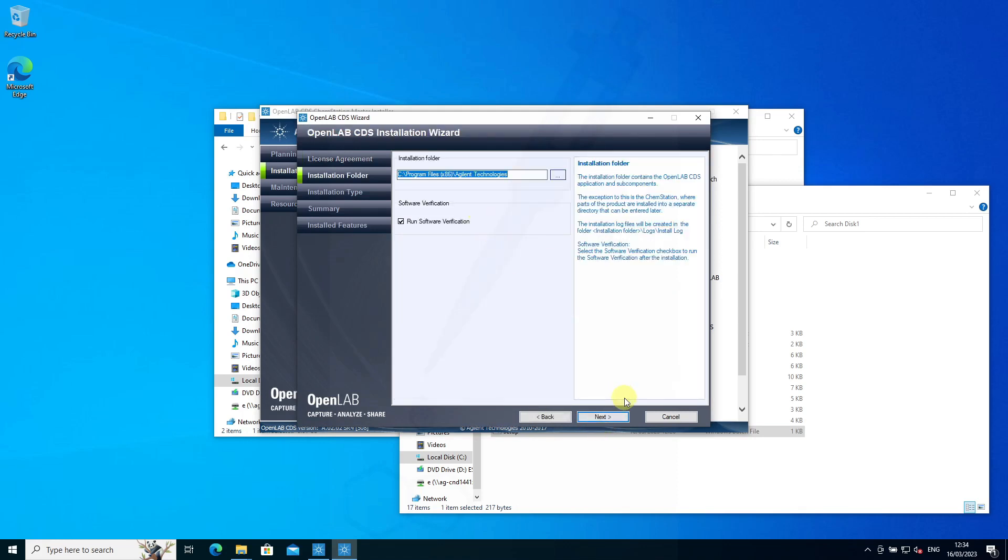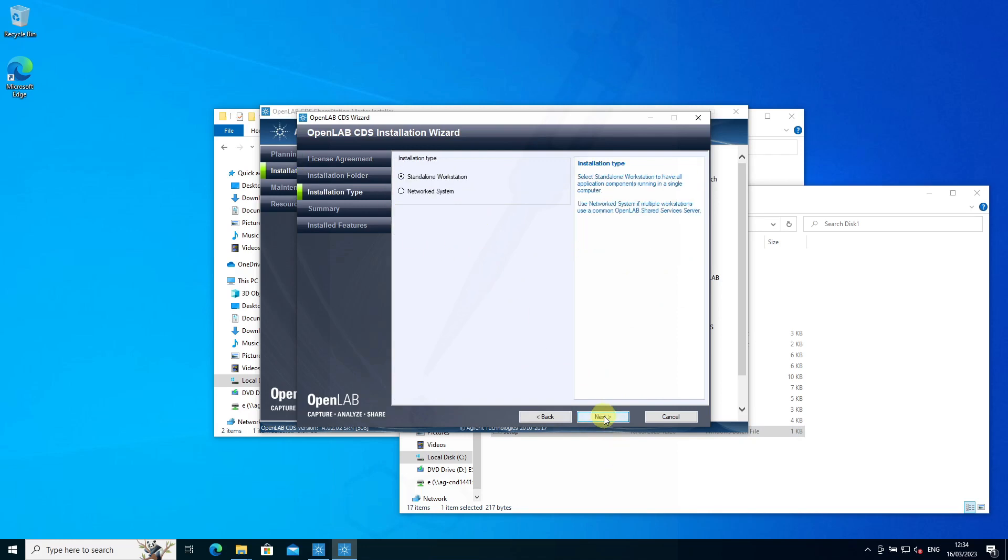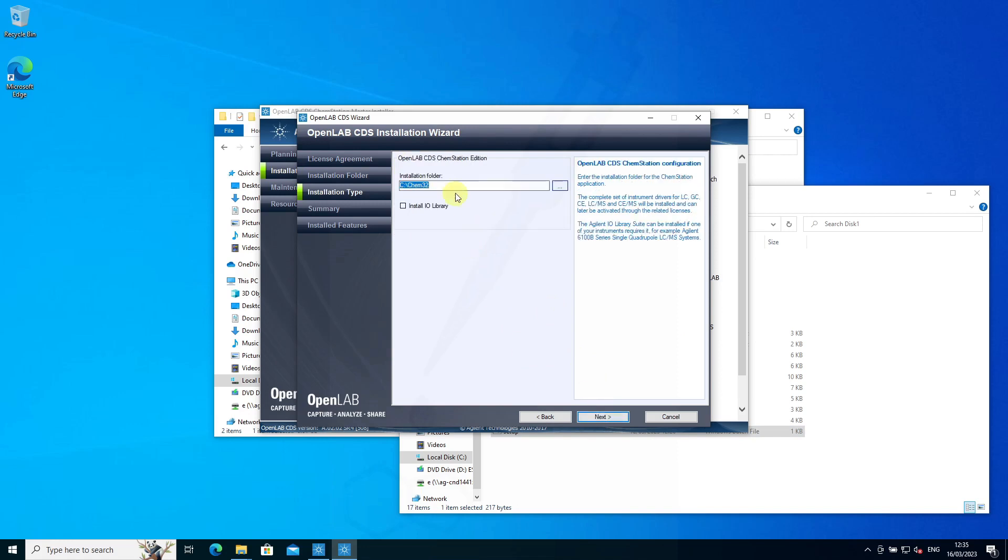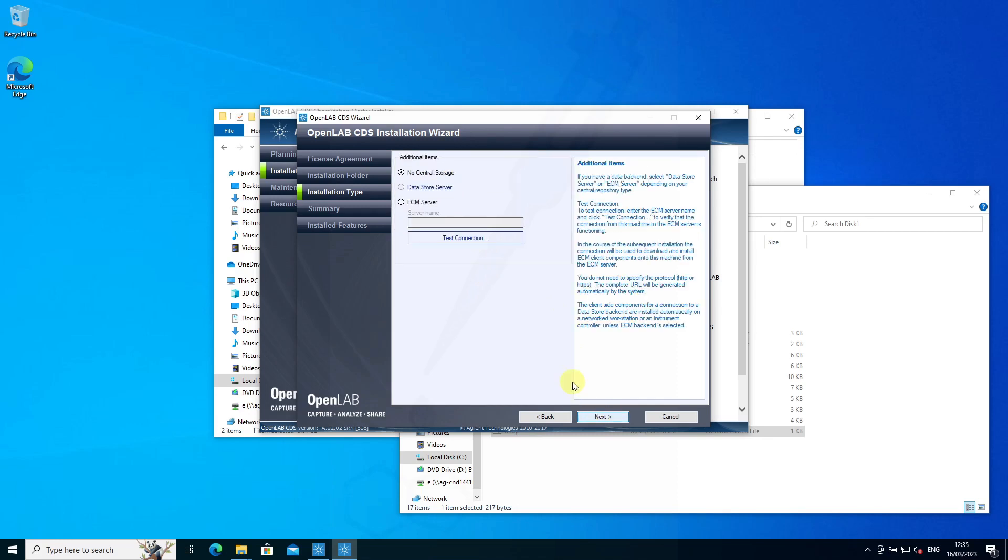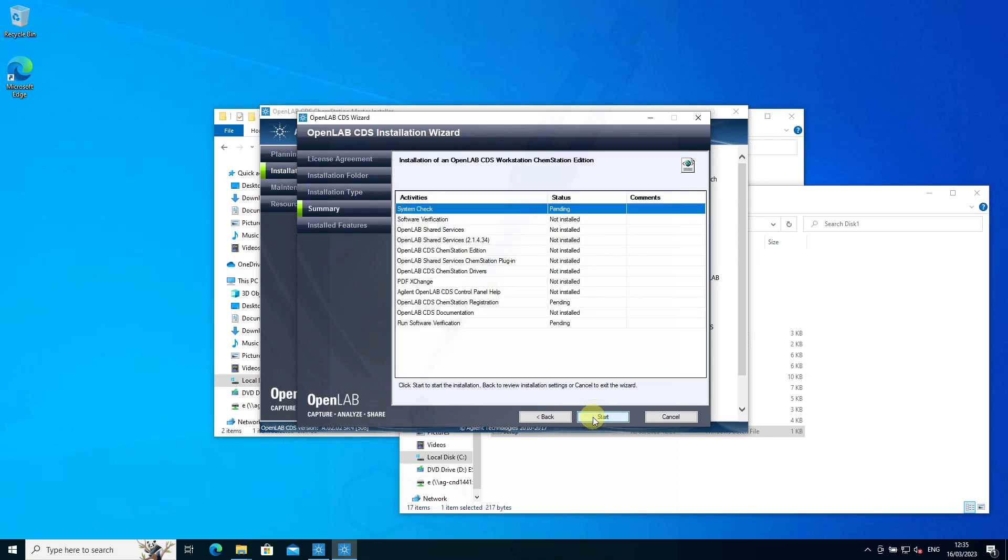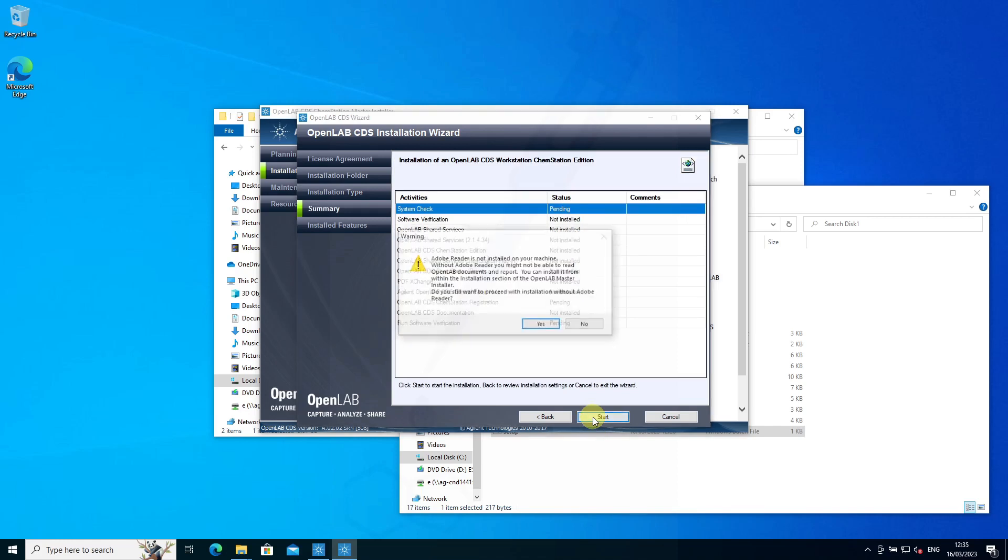I'll keep these defaults. You'll see there's a software verification that runs after the install. It's for a standalone workstation. The default folder is C:\Chem32 with no central storage. Then we can start.